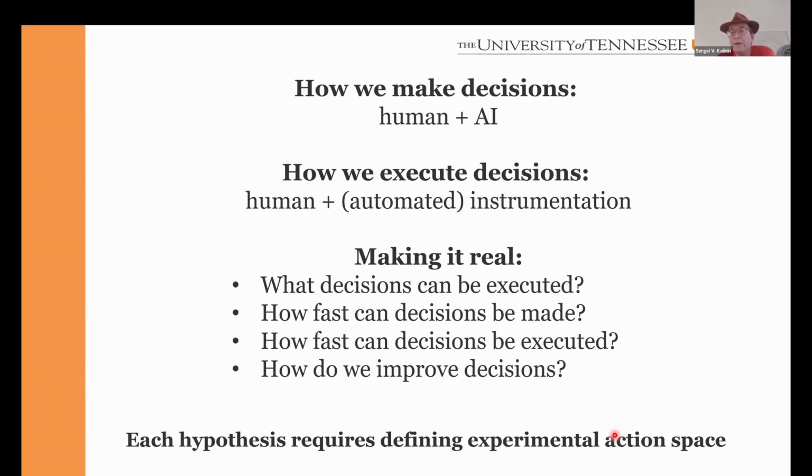Now, for all these applications, the interesting thing is how to make it work effectively and how to make it work together. So the obvious way to do that is to say, hey, we have the automated tools. We also need some form of the machine learning agent or agents that are going to interact with the tools and basically orchestrate the experiments.